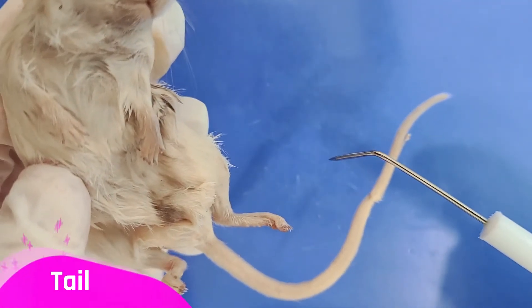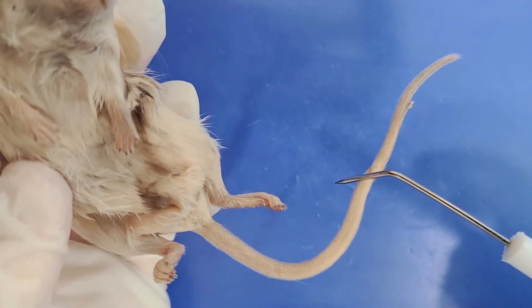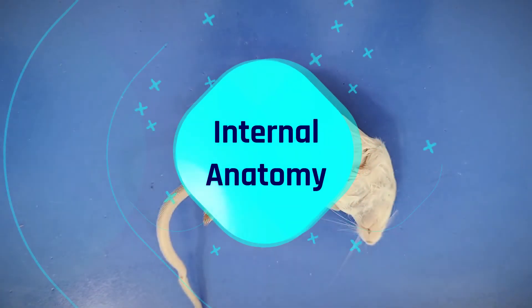We can also see the tail here. In mice, tails are used for temperature regulation and for balance. Now let's take a look at the internal anatomy.